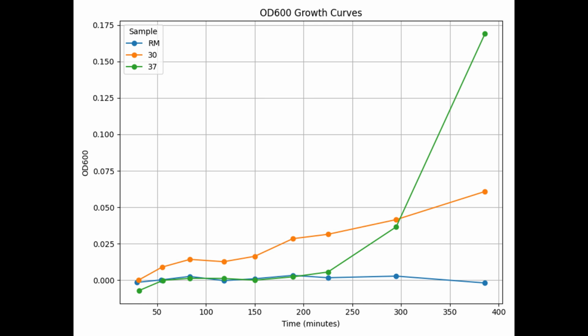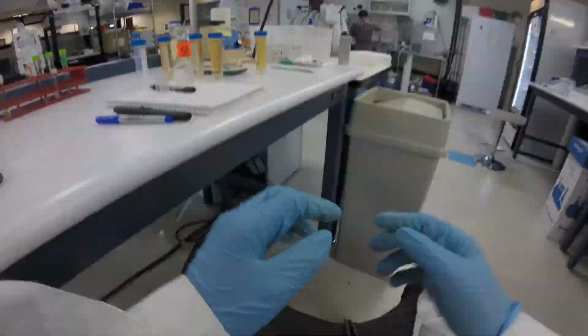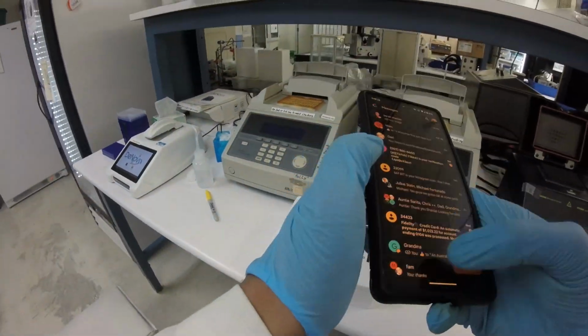But in general, what I was thinking of doing that would be really cool is to use the lab's OT2, OpenTrons robot, and maybe try to jerry-rig it so that I could get 3 heat blocks in there at different temperatures. We wouldn't have shaking, but that's a nicety. The whole point is to do an experiment where we're controlling for a single variable, which is just doing basic science. Then we'd have our culture, and we'd inoculate it with the original starting liquid culture.